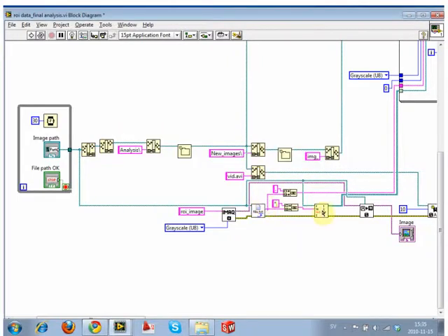And now this will never look for a VI that's somewhere else on your hard drive. It's now looking for only within that library file. So as long as you keep saving to things inside this library file, it's a self-contained environment now.